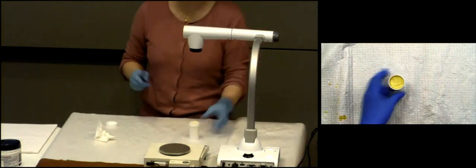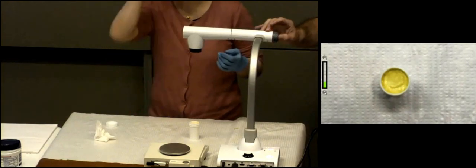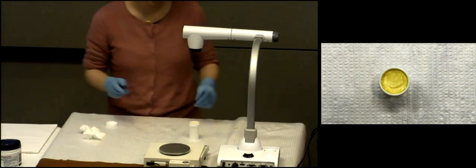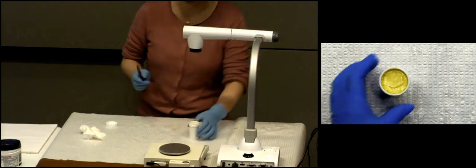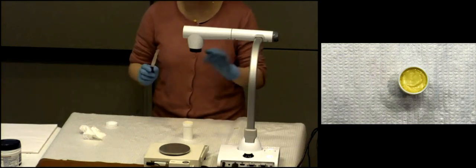So here, okay, how do I make sure that the top of this ointment looks good? Let me just say, do you see what the top looks like without it? It basically looks kind of mottled. We want it smooth with a little lip. Okay, so how can I make it look even better? I think it might look pretty good already. You have low standards. How do I make it look even better? Okay, to fit Larry's standard.